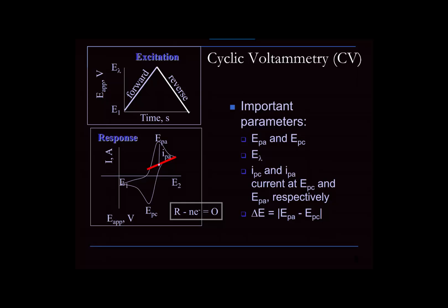The reason it rises and then falls is that initially at the electrode surface, having come by diffusion control, you have lots and lots of R, the reduced form. As soon as it comes close to the electrode surface, assuming that it's kinetically favorable, and we've said it is thermodynamically favorable, then R will get oxidized to form O. So you'll start to have a lot of current flowing. How much? It's proportional to the concentration at the electrode surface, so you're going to see a lot of current flowing.